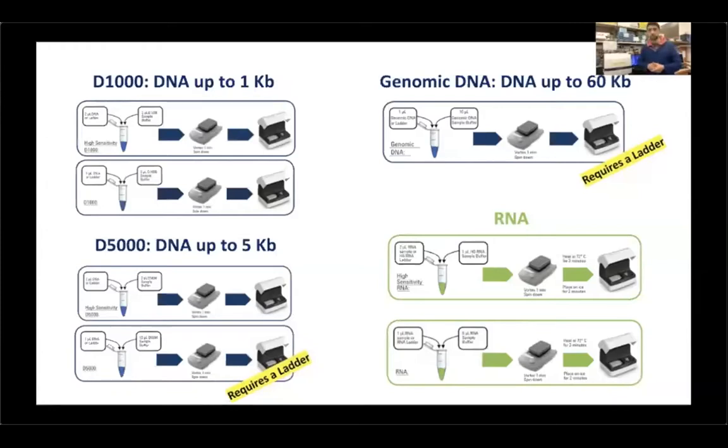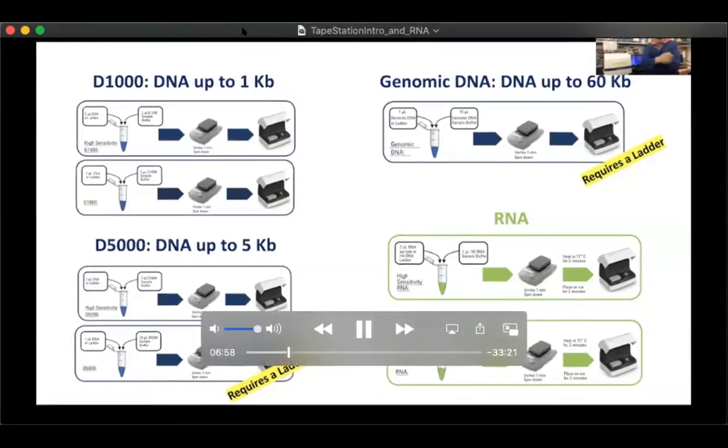Also, it seems very weird, but I like to use the genomic DNA screen tape when I'm processing cell-free DNA samples. The reason is that cell-free DNA is a very short molecule, usually between 150 to 200 base pairs, free-floating in your blood.